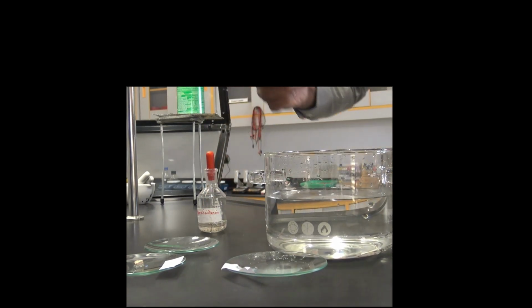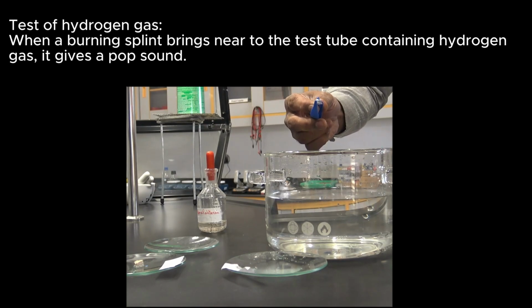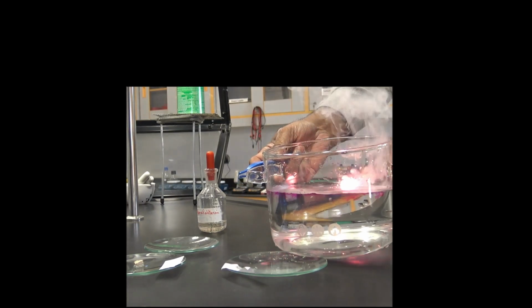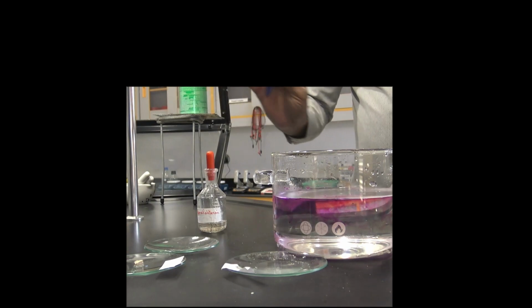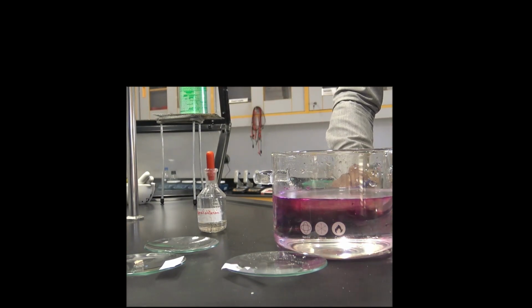Potassium reacts with water and gives you again hydrogen gas and potassium hydroxide, which is an alkali. Now you can see that clearly. It was a very vigorous reaction.